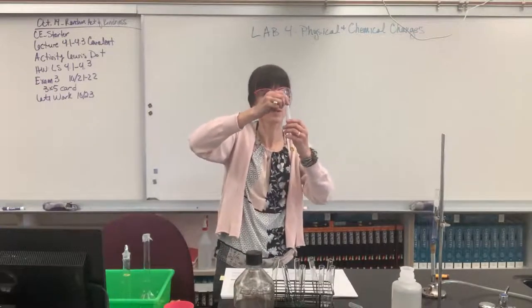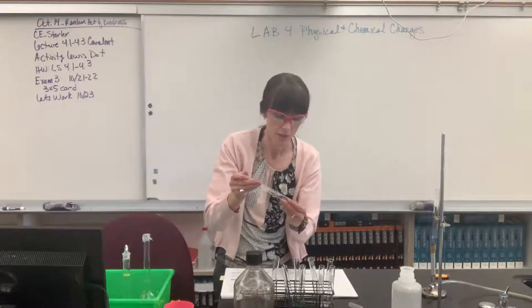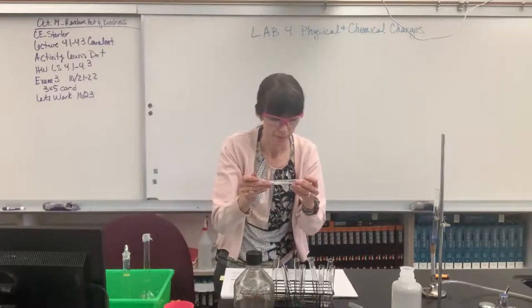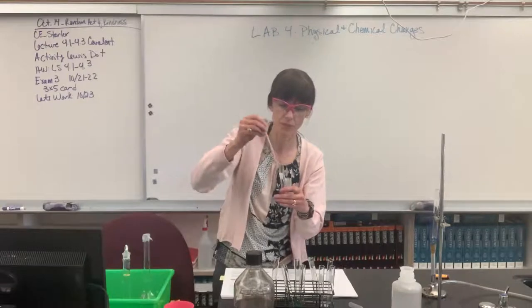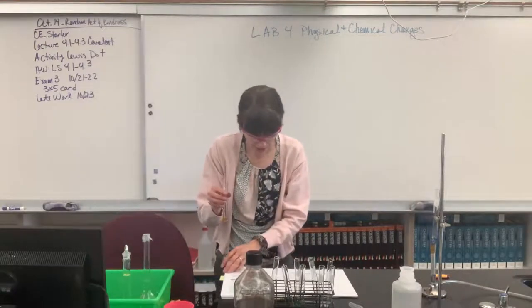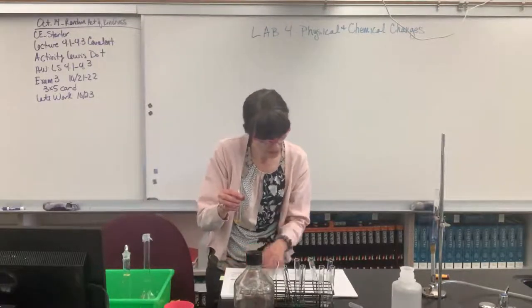That didn't help me to pull that up. Do you know what? The test tube is longer than my pipette. Oh, I'm going to have to be creative. Sorry, you guys. Nope, it's not going to let me do that. Sorry. We have to divide this into thirds, in essence. I might just eye it, you guys. I apologize that that pipette isn't long enough.